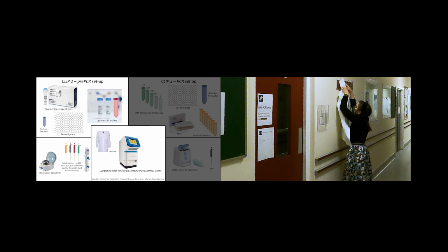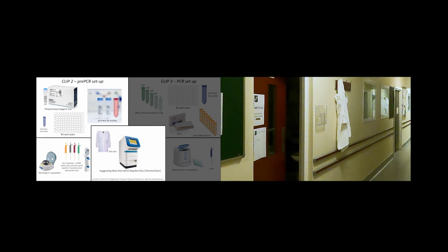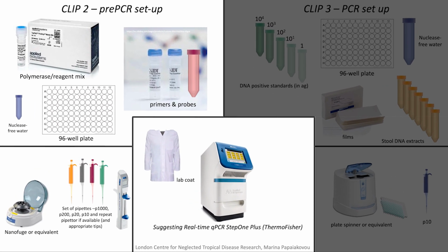Before you do any pre-PCR setup, make sure the concentrations of your primers and probes are where you need them to be. The recipes found in the SOPs for the qPCR detection of soil-transmitted helminths are all based on 10 micromolar concentrations. See the SOP for more details in preparation and details in sequences of the primers and the probes. References and published sequences are also found at the end of this video.